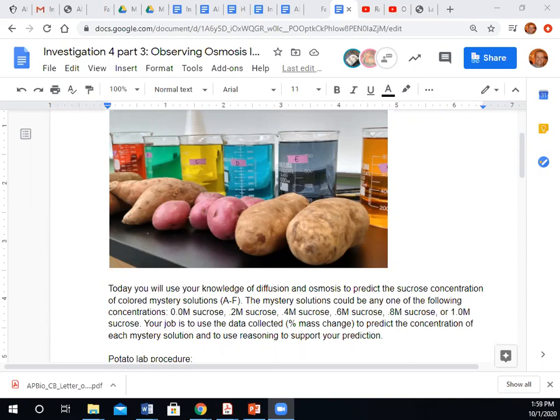And when you think about it, this potato compared to any other potato in the bag, is it going to be identical? Why not? Even if it's the same kind of potato, why not? Shape and size, and whatever condition that potato was grown in may have been variable. It's not like all the potatoes in one bag came from the same plot of land. It's just this massive collection of potatoes.